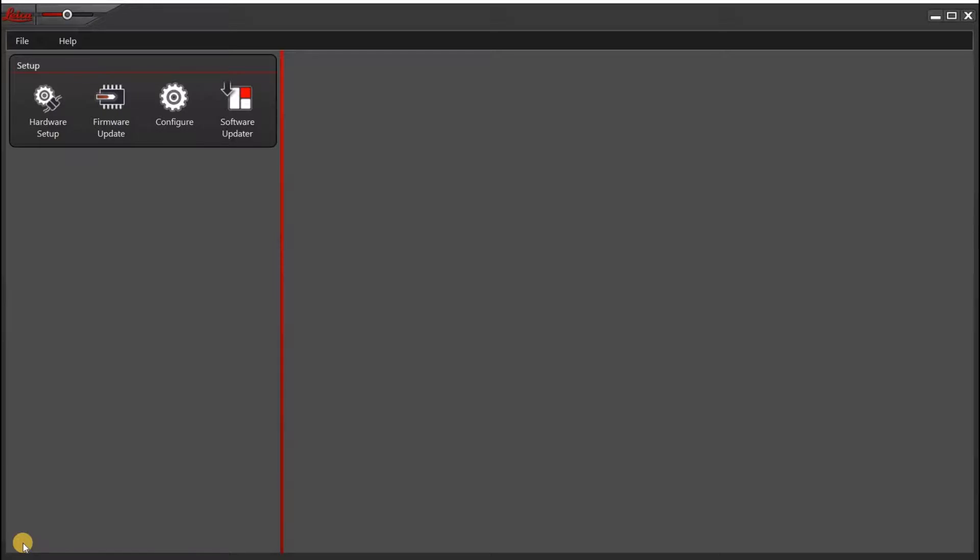So the first thing you want to do is open the Leica LASX hardware configurator, which I've already opened up here.